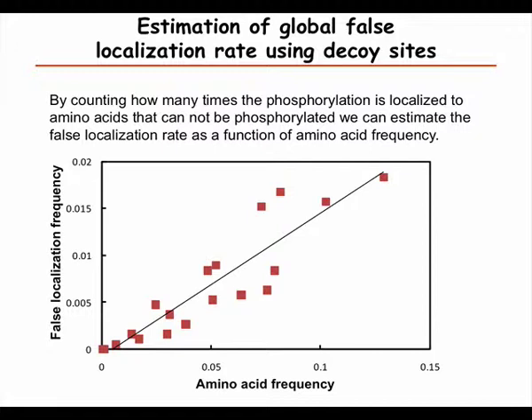In this experiment we enriched for tyrosine phosphorylation, so most of our phosphopeptides should be tyrosine phosphorylated. But we also saw that we identified quite a few serine and threonine phosphopeptides. So the question is, is there a propensity for the enzyme to also enrich for those?